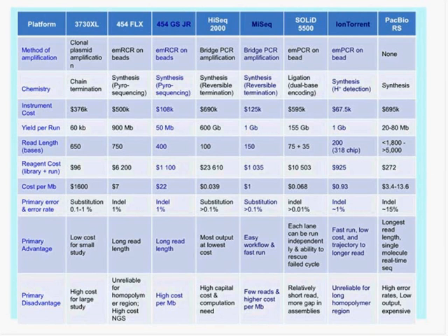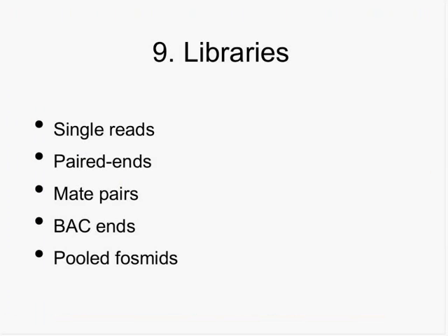This is one of those things where you want to discuss it with your partner who's been doing sequencing before and said, oh, we use a mixture of these kinds of things, or this technology we like with this assembler. You'd be hard-pressed to want to solve this on your own. The only time you might want to try and solve something on your own is when somebody offers you an incredible deal and says, we'll do this stuff for free, and then you would take that, and then you might add some other stuff to it. Sometimes you get those kinds of deals.